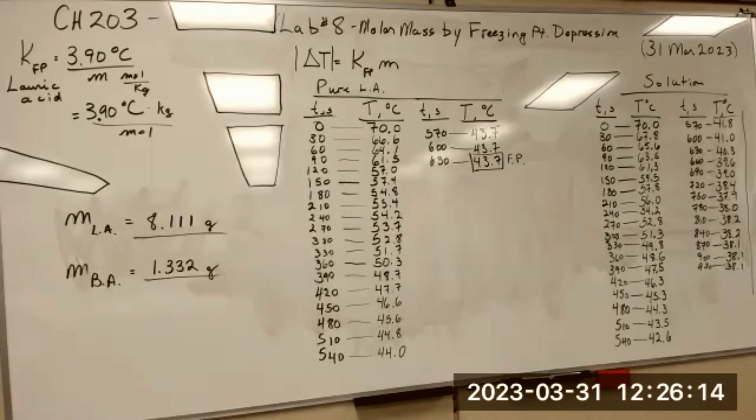Okay, so let's fill this in. That's all the data. I think our procedure tells you to graph the data. Yes. That's why we did that graphing data first.